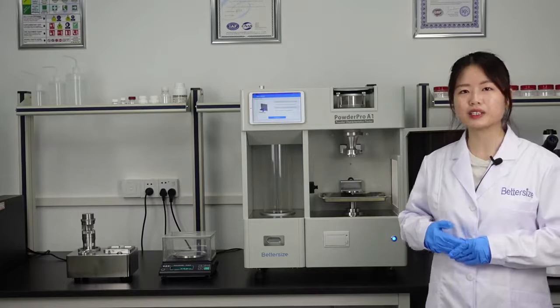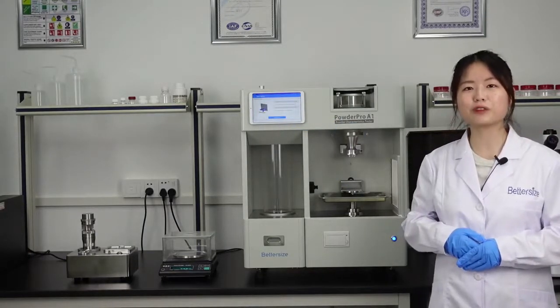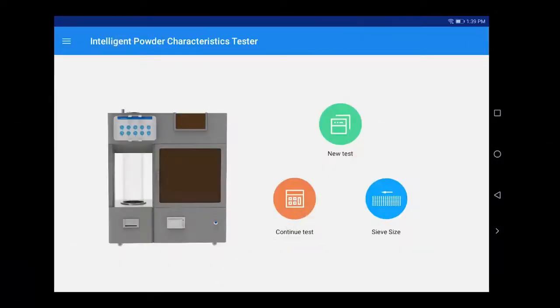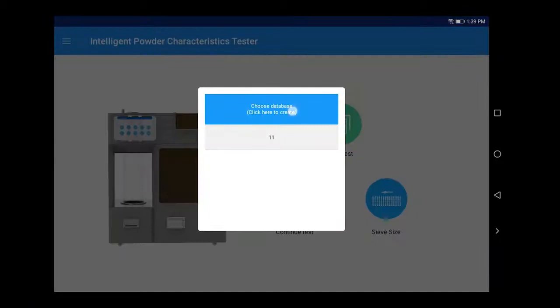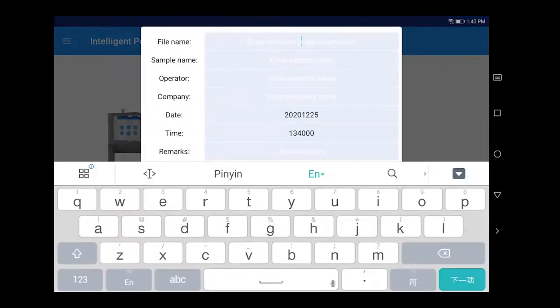The PowderPro A1 is controlled by the app, Powder Tester. Let's start with measuring the angle of repose. First click New Test to create a database. Fill in the file name, sample name, operator and other information.